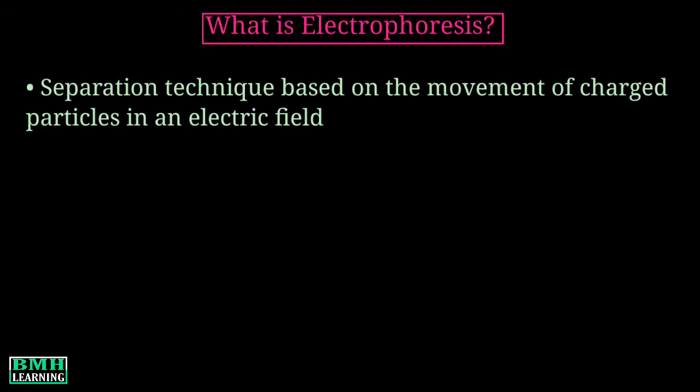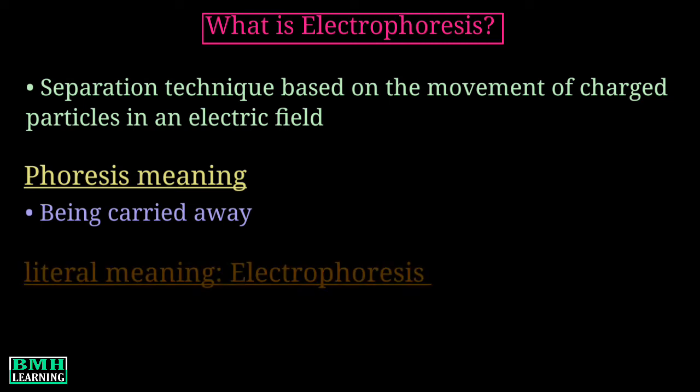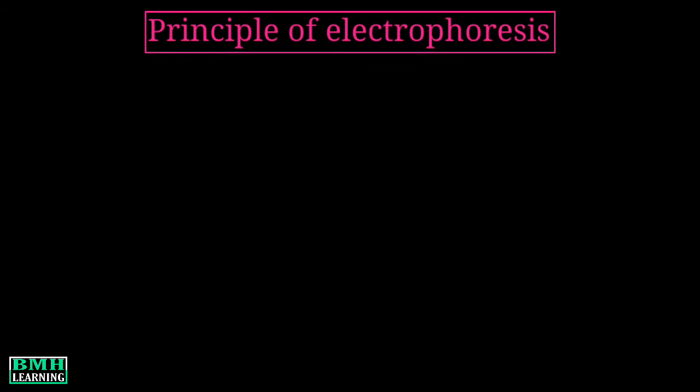Electrophoresis is a separation technique that is based on the movement of charged particles in an electric field. The meaning of the word phoresis is being carried away. So the literal meaning of the term electrophoresis is to get carried away with electricity. Now let's know the principle of electrophoresis.